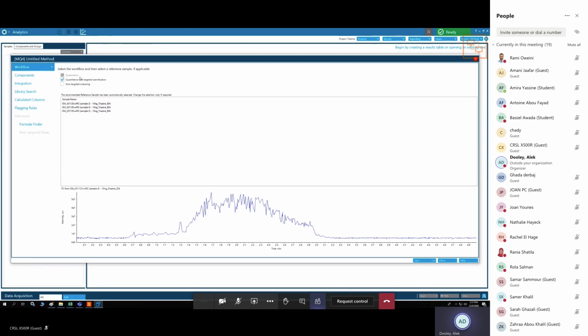It also has quantitation always. So that just means you're going to get peak integration. Whether you want to actually do quantitation or not, that is up to you on how you interpret the data. But we're going to start down that path.